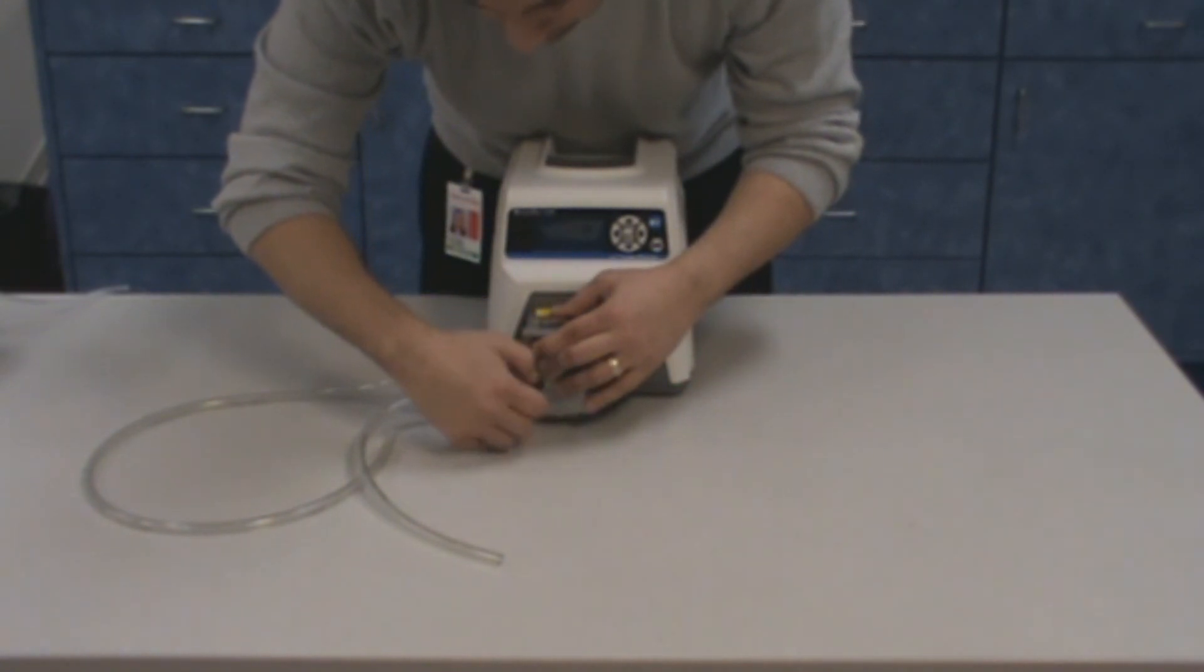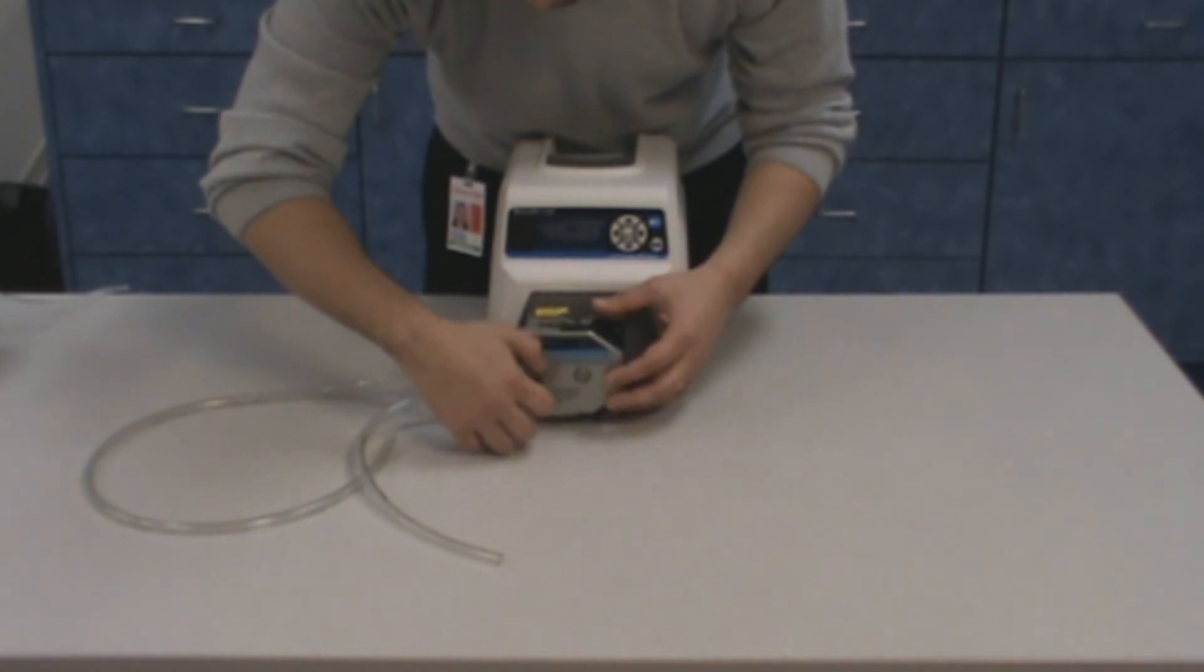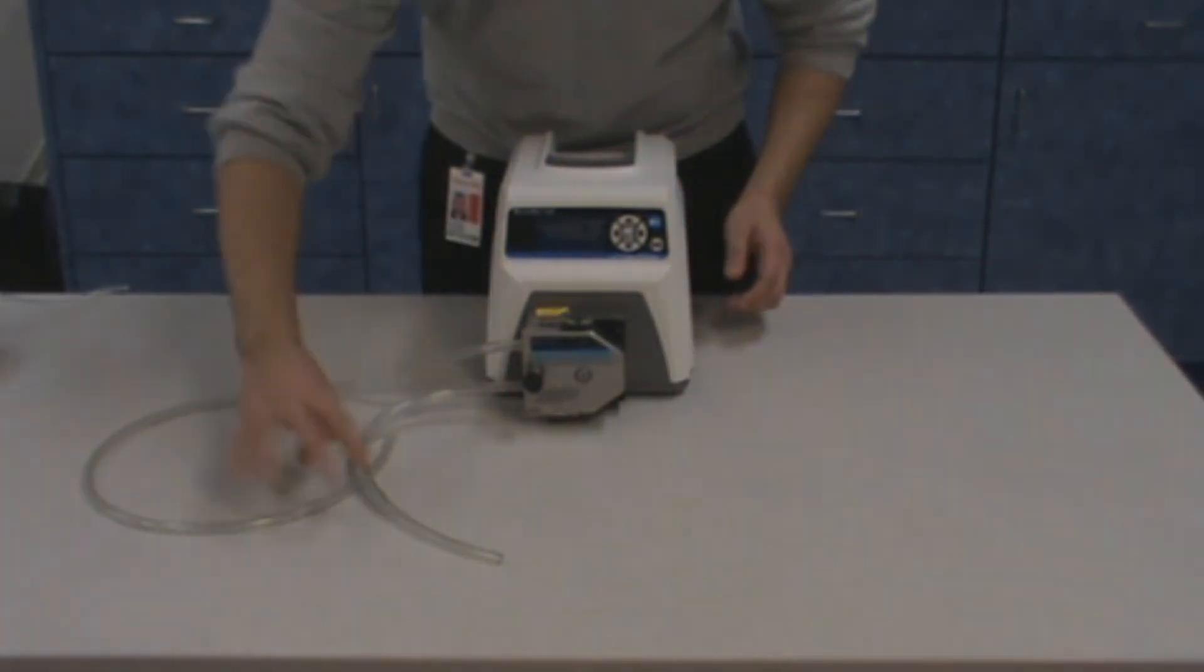Next, tighten the tubing retainer by rotating the tubing retainer knob clockwise to prevent the tube from moving. Now you can turn on the drive and your pump is ready for use.